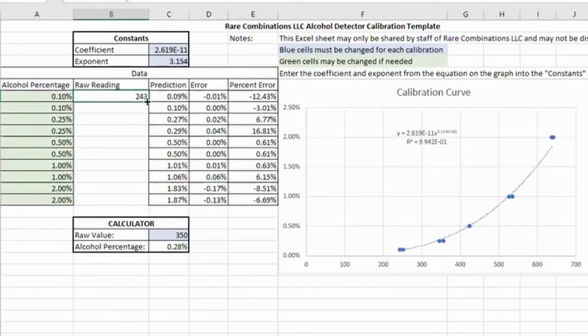And you don't need to go out to 2 more decimal places after this. You only need the ones place really, because that's sort of all of the resolution that you're going to get. So you've done your first sample, you screwed it in, the reading was stable. It might have been bouncing around from 240 to 245 and then 243, you assume that it was at 243 for the longest, so that's the number that you use here. Then you unscrew that sample.